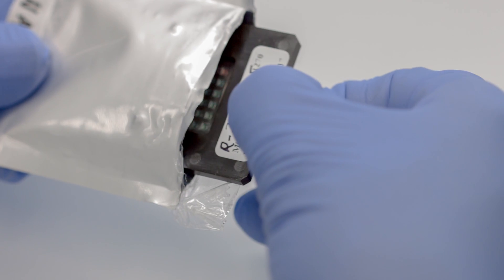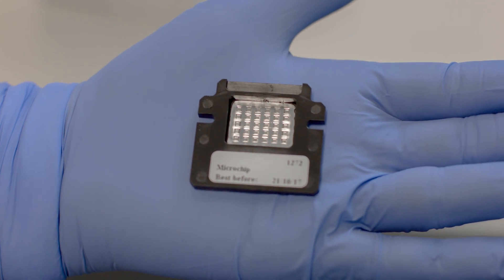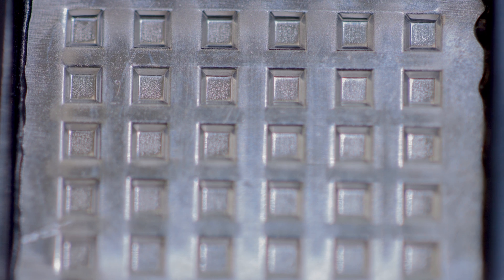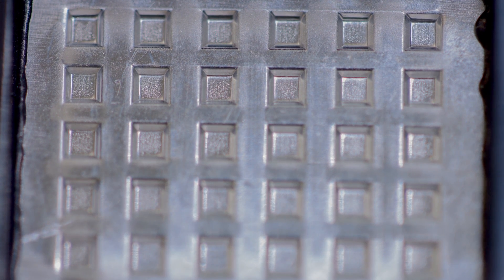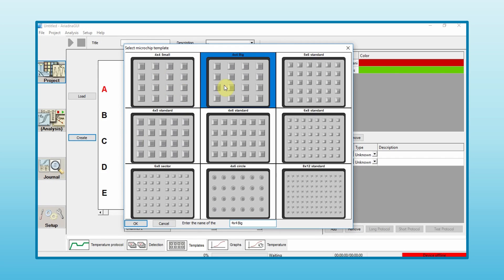The core of the instrument is the microchip technology. A typical microchip contains 30 micro-reactors. Other formats have a different number of micro-reactors, like 24 and 48.